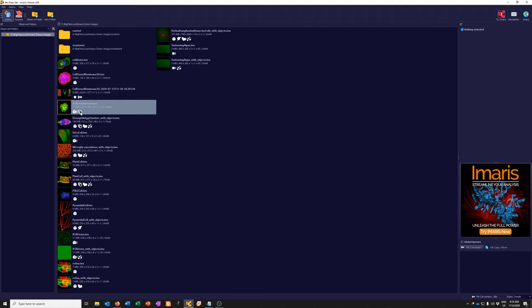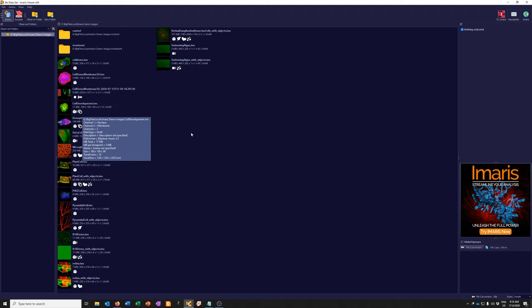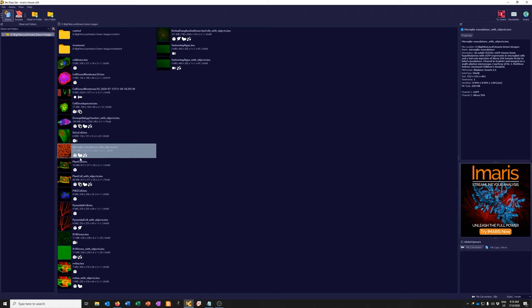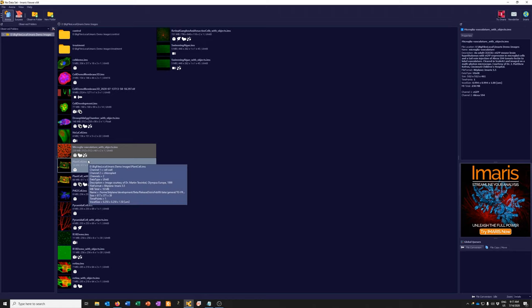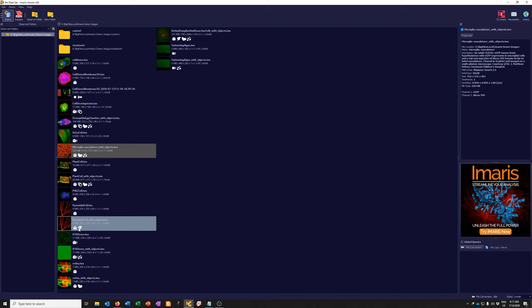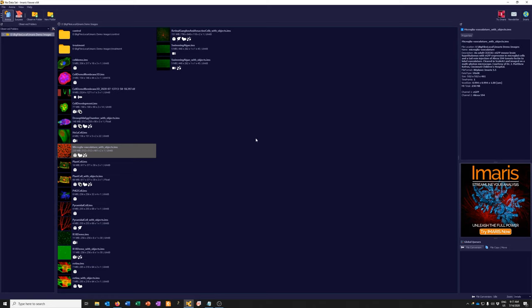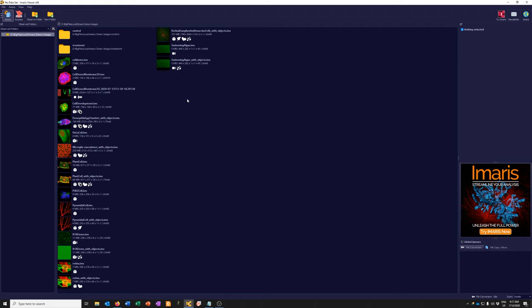This blob that looks kind of like a cell with a nucleus and other vesicles means that this data was analyzed in Imaris and an object called a cell was made. These splotches and dots mean the image was analyzed and elements called surfaces or spots were added. This little leaf reflects the fact that filaments were incorporated into this image. There's a lot of information here — just by looking at it, you get a sense of how the data is structured.